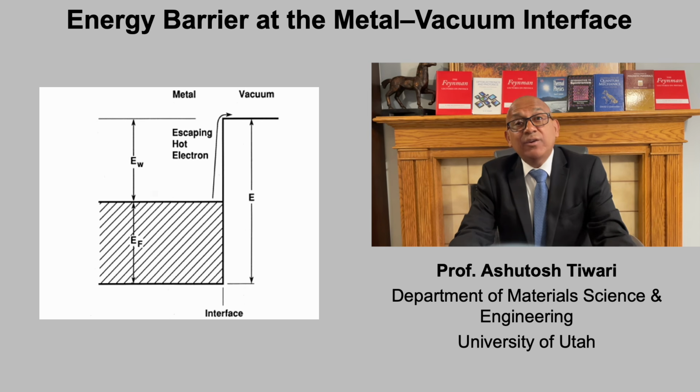The higher the work function, the harder it is for electrons to escape, and the higher the temperature required to generate usable emission. This is why materials with lower work functions are preferred for electron sources. They allow emission at lower temperatures, improving efficiency and filament lifetime.